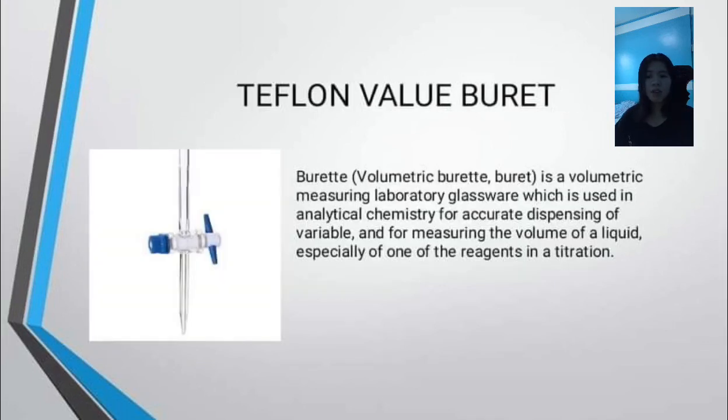The Teflon stopcock burette. A burette or volumetric burette is a volumetric measuring laboratory glassware which is used in analytical chemistry for accurate dispensing of variable volumes and for measuring the volume of a liquid, specifically one of the reagents in a titration.